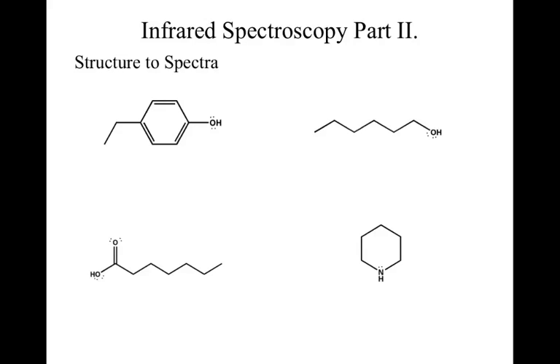When you look at IR spectroscopy, remember what it's trying to identify. You'll hear a bunch of variations of this, but really when you hear IR spectroscopy, the only thing that I want to come into your head is bond. Okay? Not functional group. Everybody says functional group, and it's half right. Stick with bonds. So if you're trying to go from the structure to the spectra, what you need to do is identify the bonds that show up within the structure.